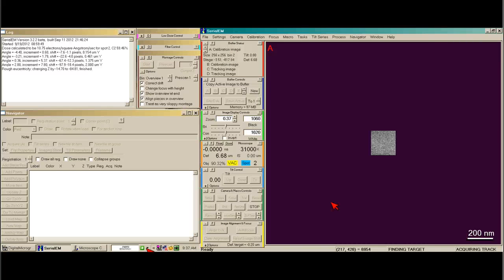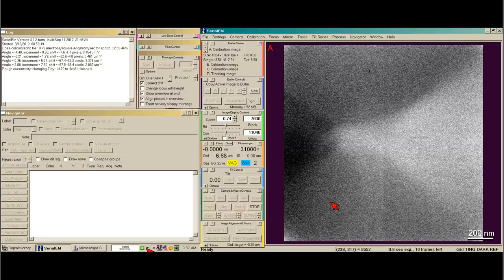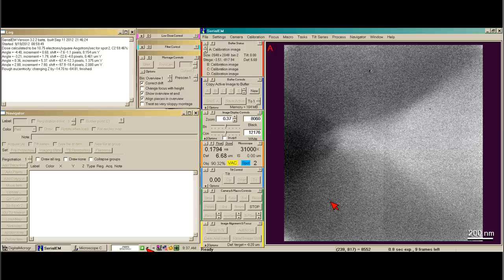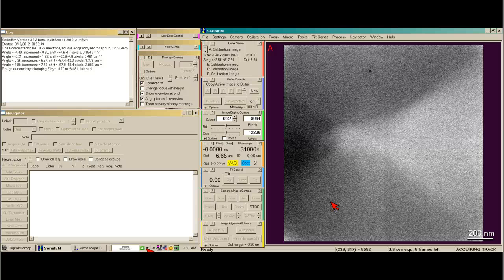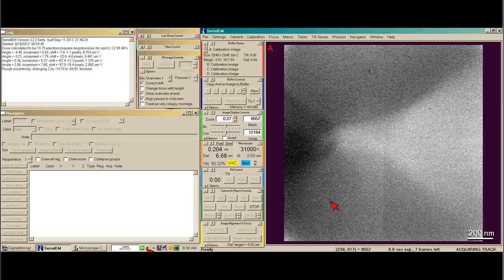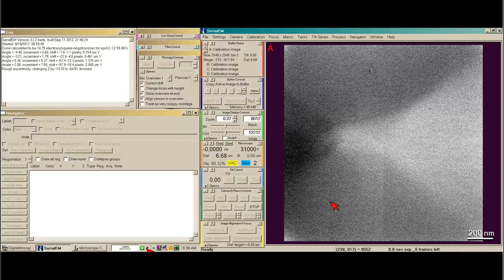Before the gain reference is done, we usually do our direct alignments. So that would be the gun tilt, gun shift, beam tilt PPX, beam tilt PPY, beam shift, and rotation center. And of course, all those direct alignments should be done with your CompuStage at eucentric height and in focus.